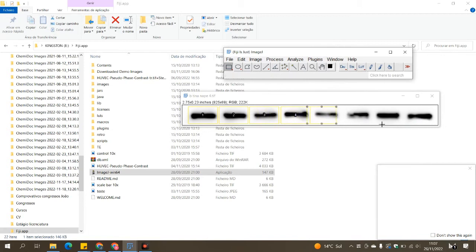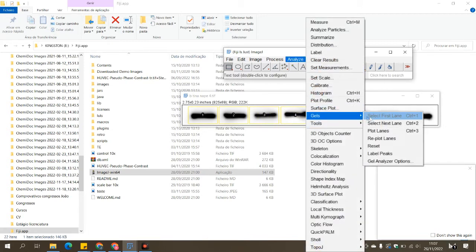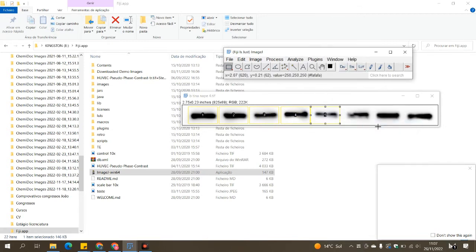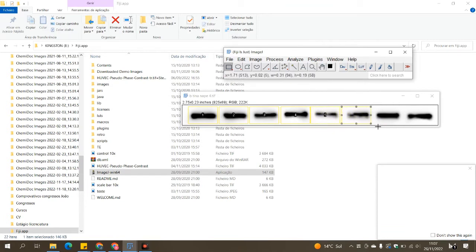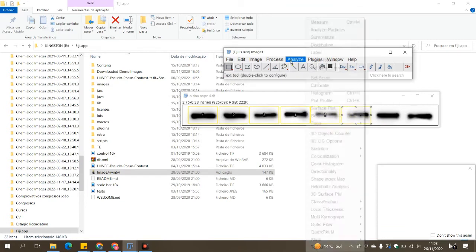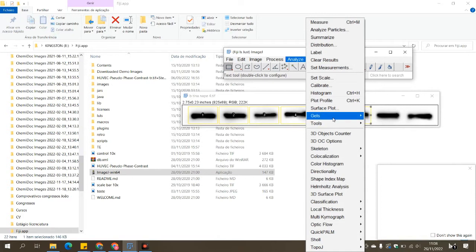Alternatively, you can select your first lane with Control+1 and the other ones with Control+2, so you don't have to go all the time to analyze and then select next lane.